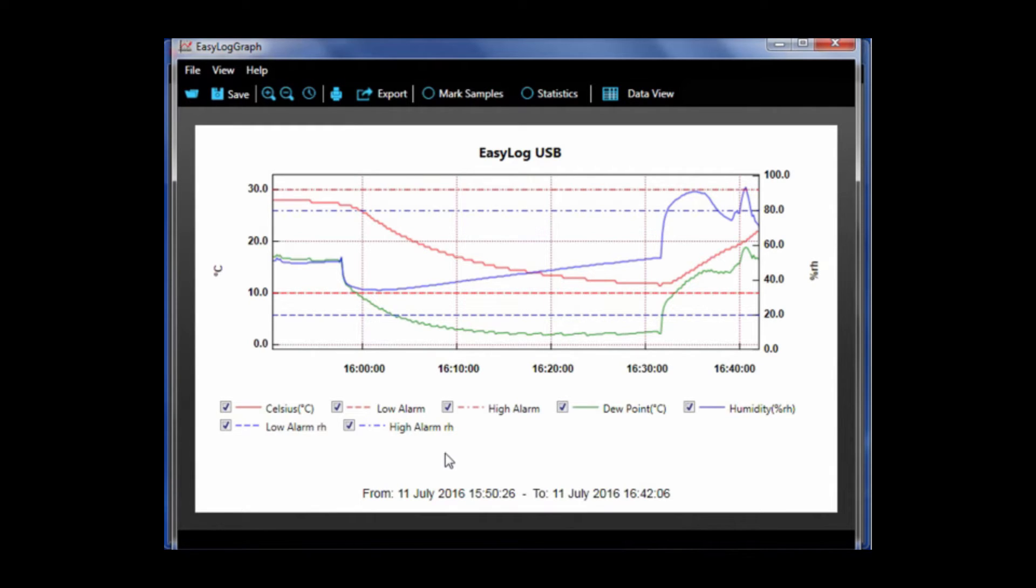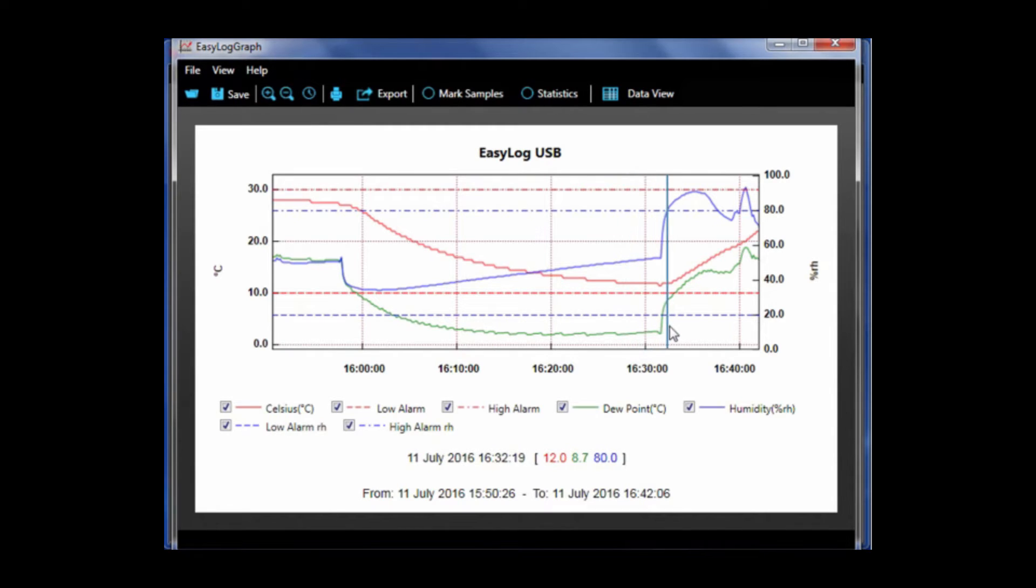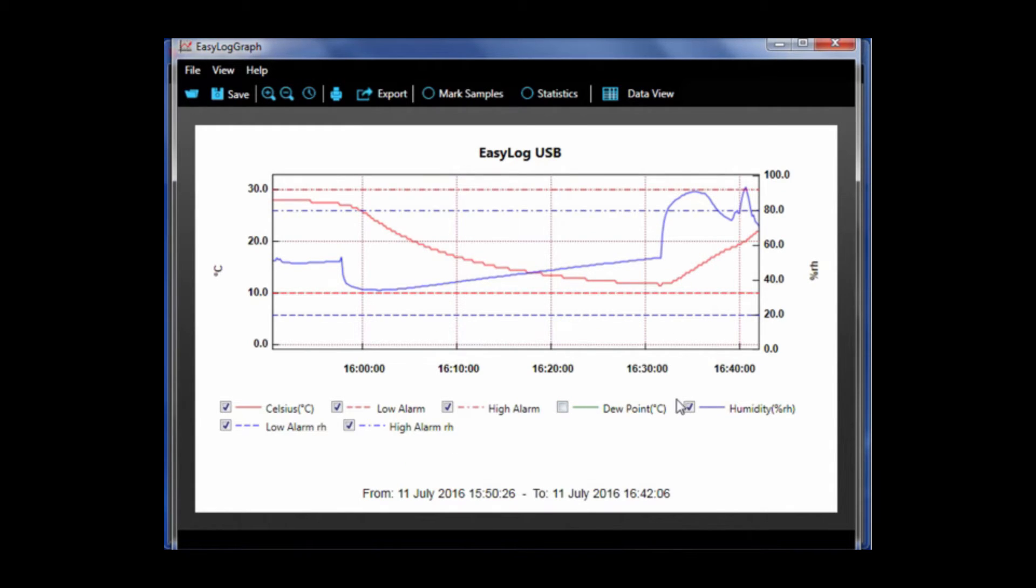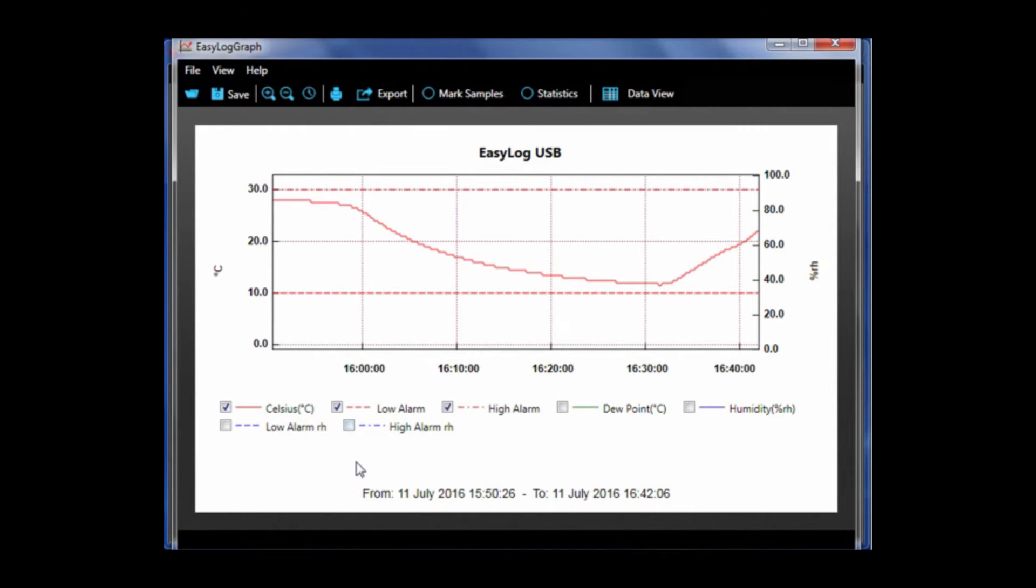If you notice, as I hover over the data points the numerical reading of those are shown at the bottom of the screen. You're able to turn off different traces, so I'm just going to turn off the humidity and the dew point trace as well as their associated alarms and just leave temperature.